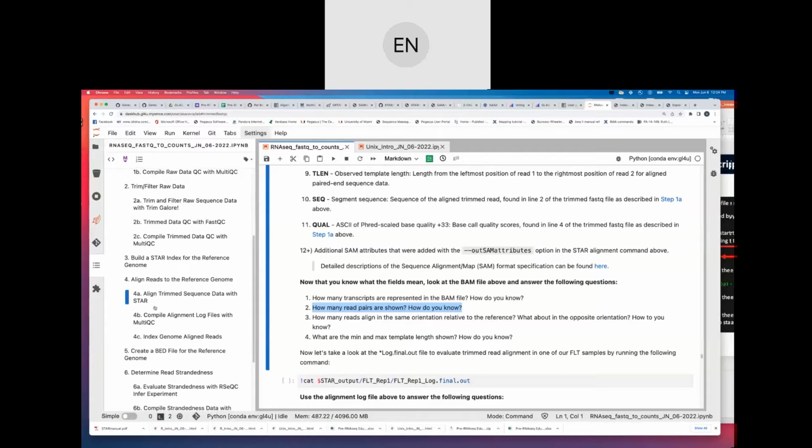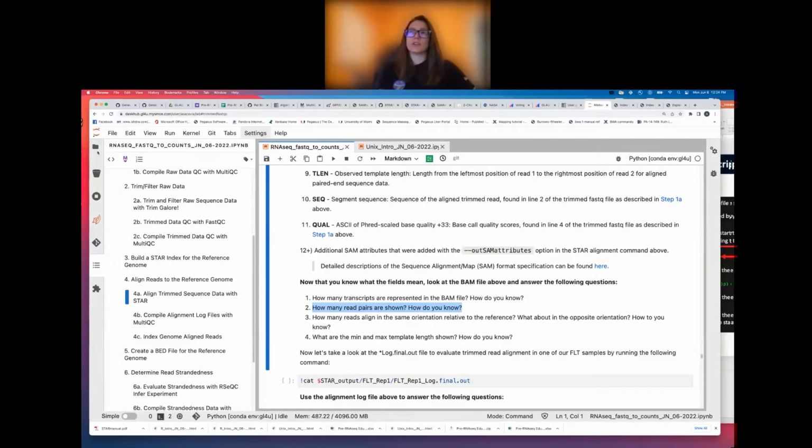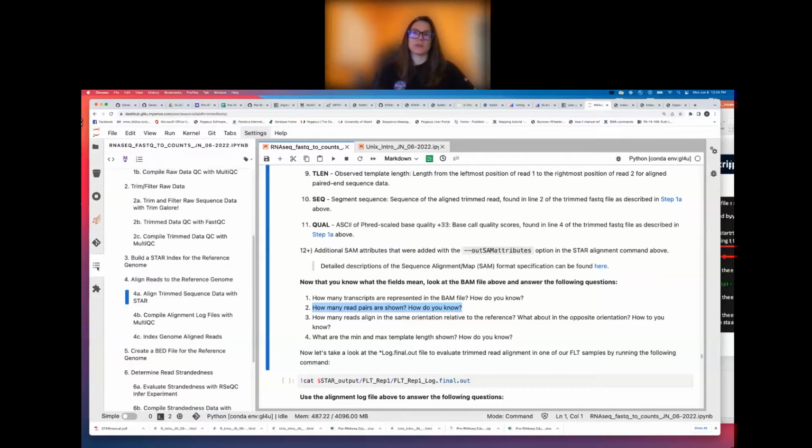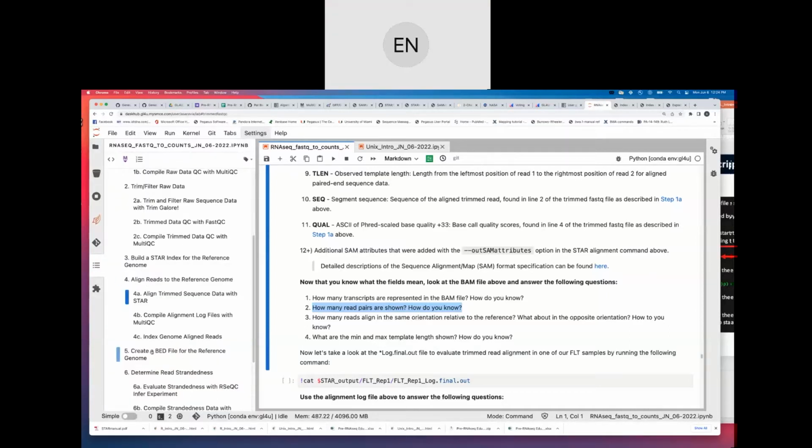So what did you just click on? On this left-hand panel, all the way on the left-hand side of your Jupyter Hub, if you go all the way to the top and click the folder, that's showing the home directory where we are. But if you scroll down to the one above the puzzle piece, the bullet points will give you the table of contents. Perfect. Thank you. Thanks, Lauren, for that tip. That makes a huge difference.